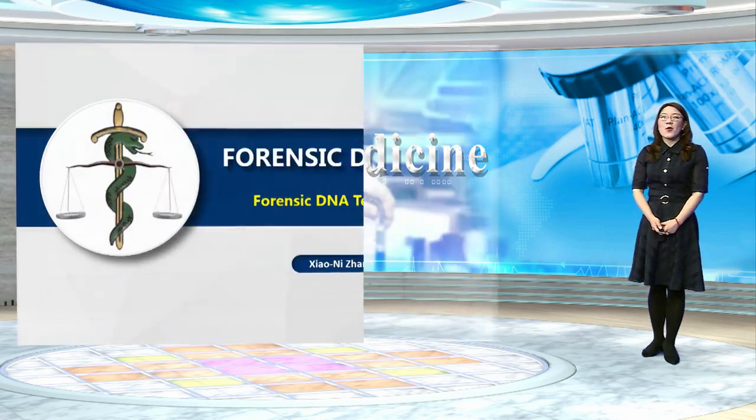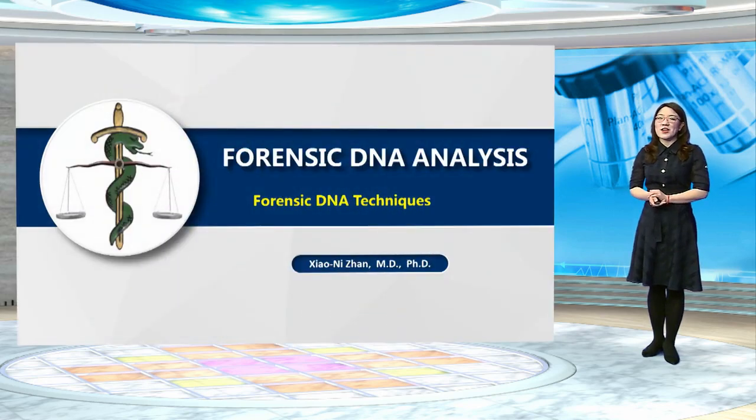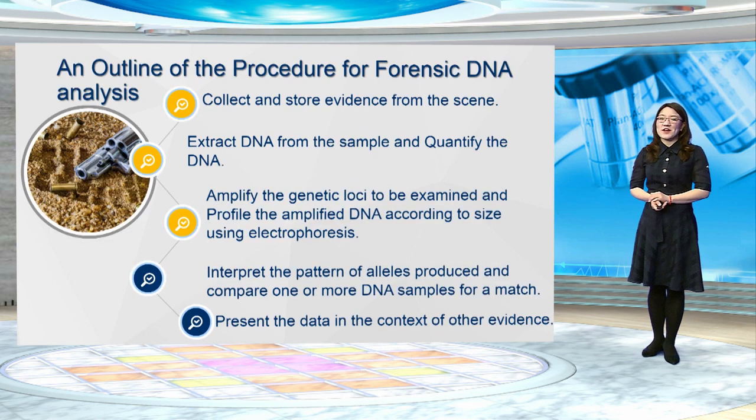In the last section, we have learned something about the basic knowledge of DNA and the genetic markers. Congratulations, you have made the first step to a DNA analysis. In daily work, the forensic DNA analysis consists of a series of complicated procedures. Here is a basic outline of the procedure for forensic DNA analysis.